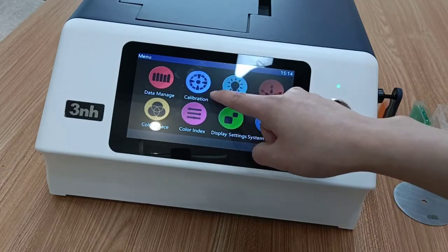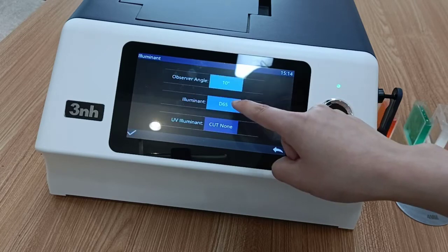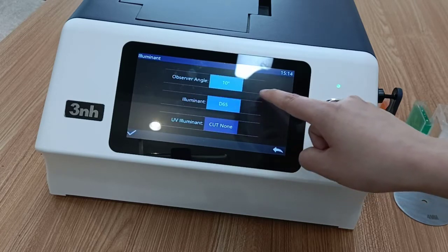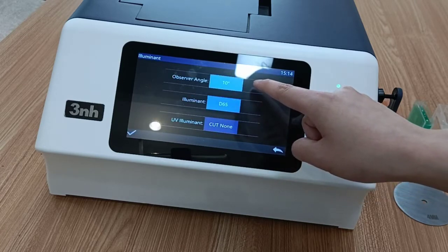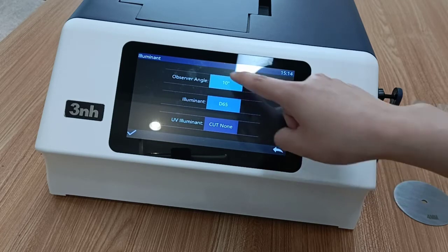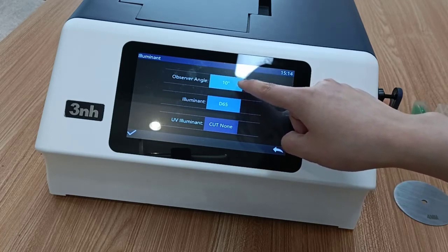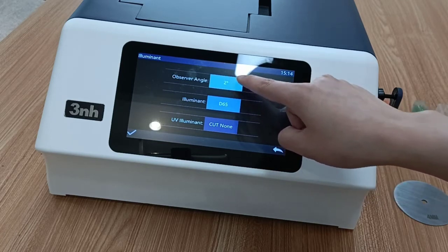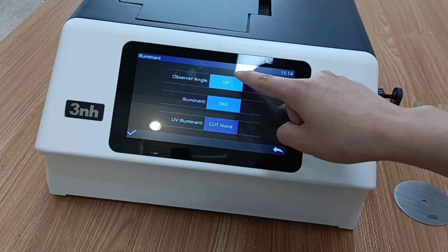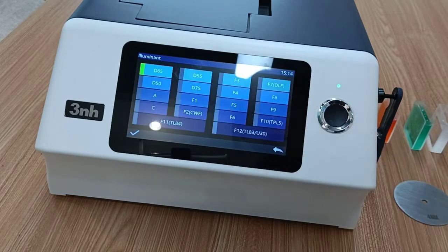The second one is calibration. This is the function of illuminant. There are two observer angles: ten degrees and two degrees. These are the illuminant options.